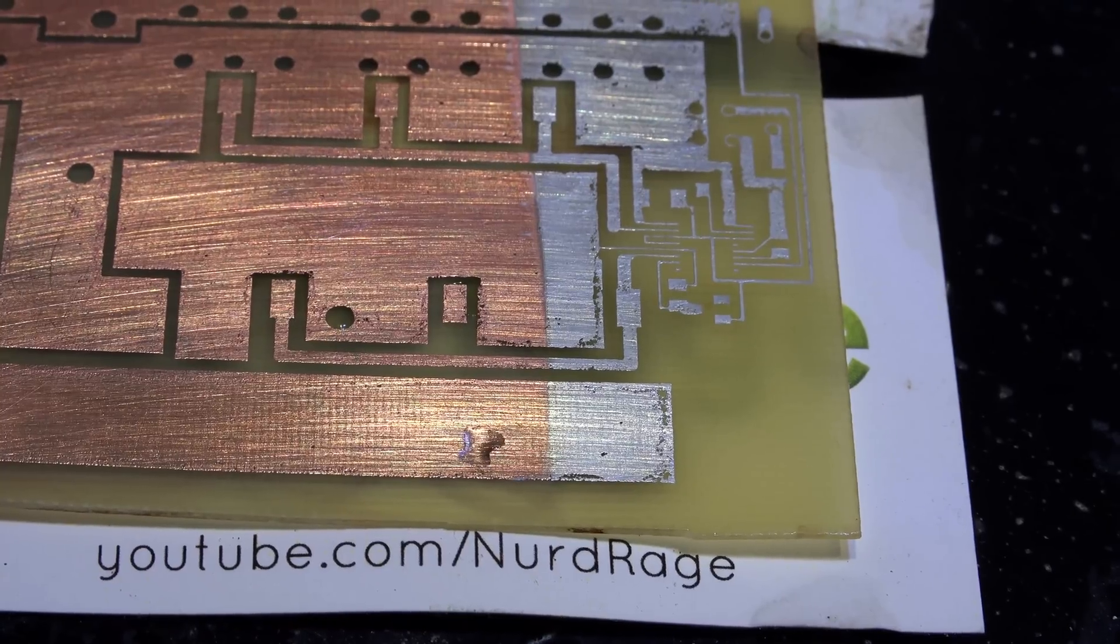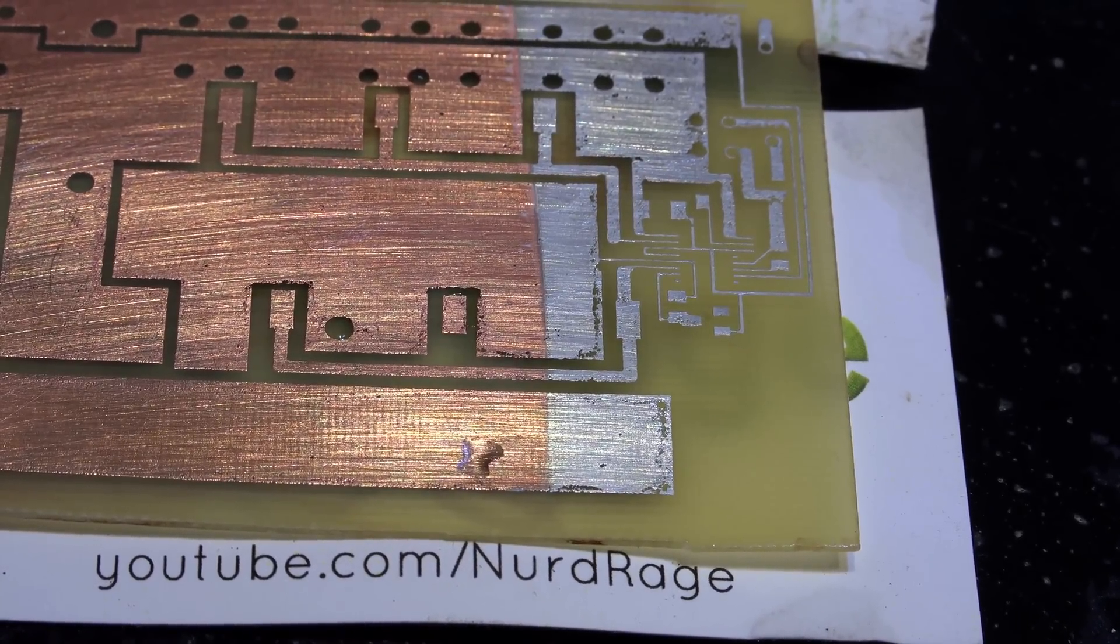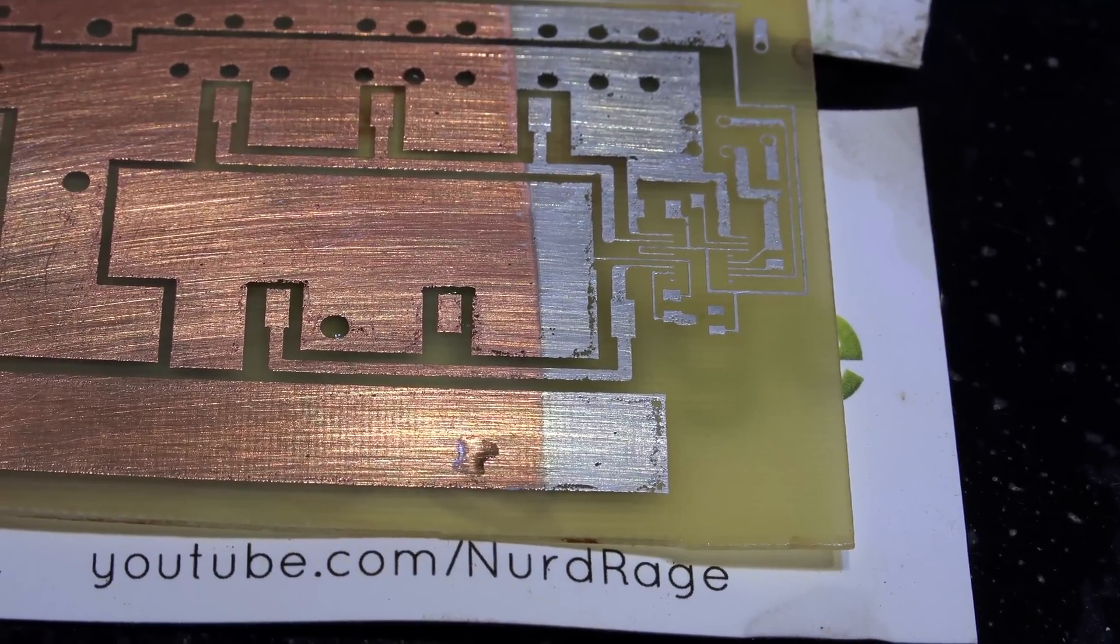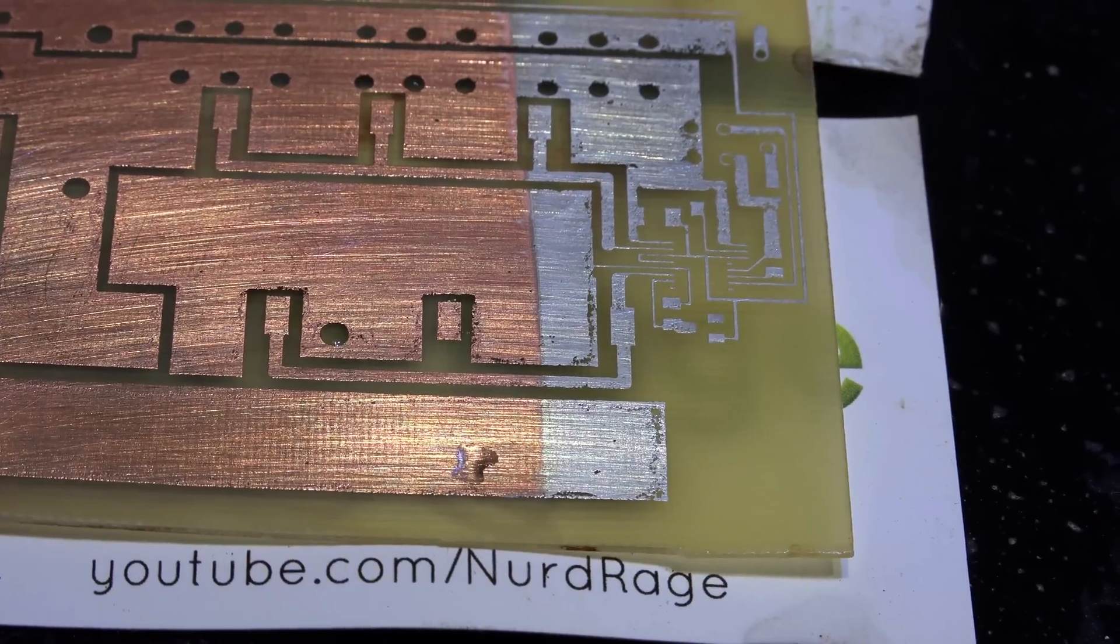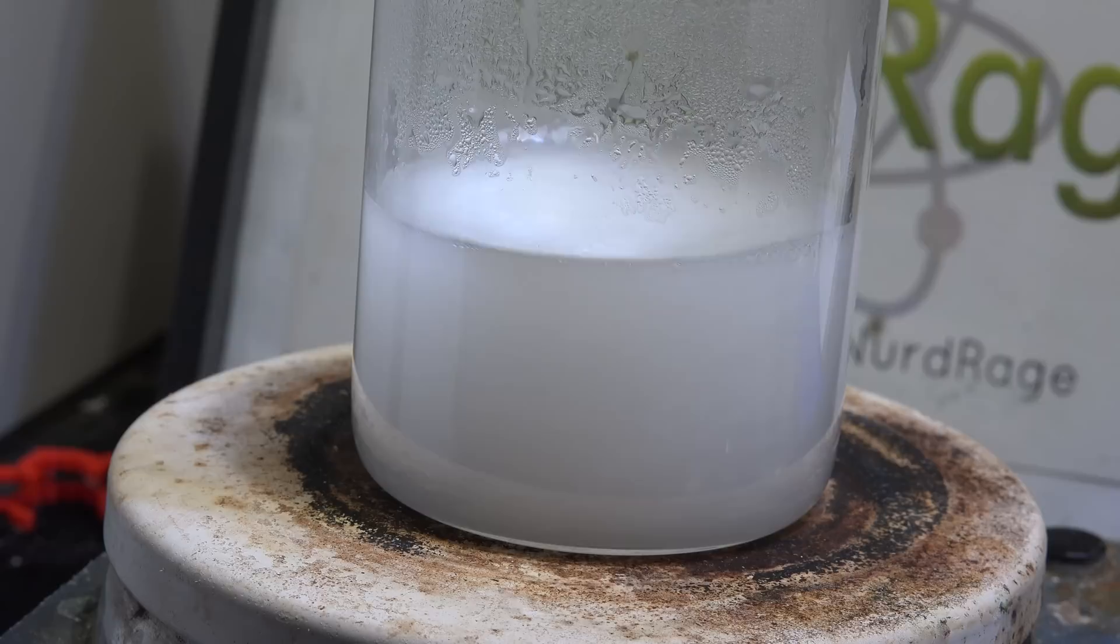This process is used by electrical engineers to protect their circuit boards from air oxidation and make them easier to solder. While not strictly necessary and not used by all engineers, it does help in some cases. Now a special note if you're doing this yourself, you don't actually need to heat it until it's clear.